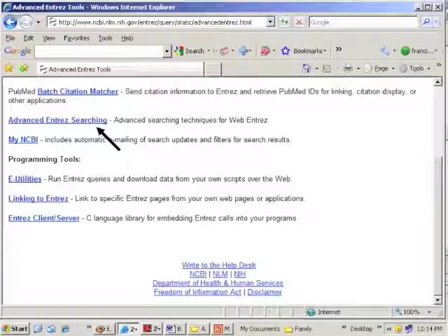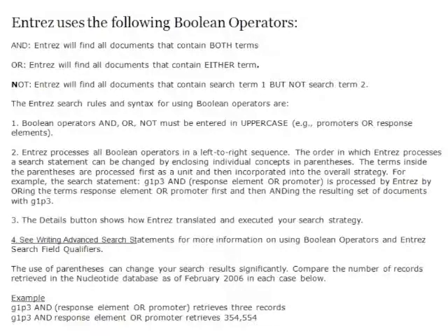So one of the things that we're faced with as sequencing becomes less costly and more efficient, there's a lot more information out there. And so we have to be better at sorting through it to get what we want. Okay. So the ENTREZ browser uses Boolean operators, AND, OR, NOT, all capitalized. Okay, those are key commands that can help you search. They also use search field qualifiers. Okay, and learning some of these search field qualifiers can also help refine what you're doing. And so what I want to do is provide you some specific examples of that.